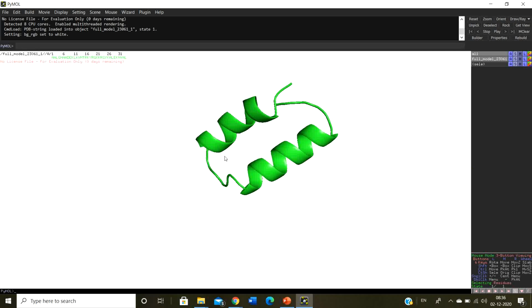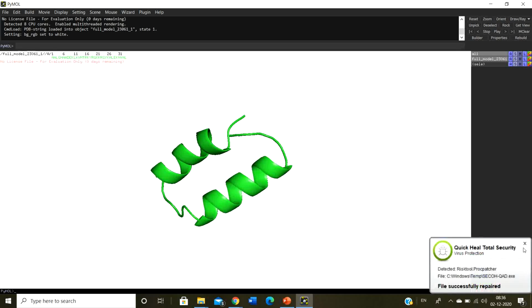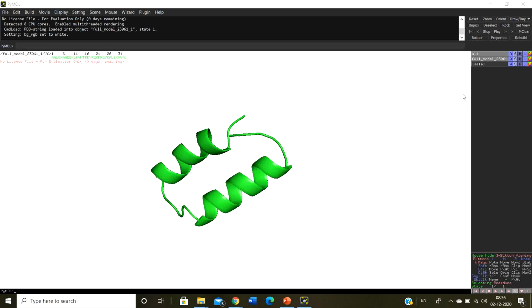Now you see there are several panels or boxes called A, S, H, L, C on the right side. There's one called all, and beneath all you are going to have your model. The model you select is going to have that particular model. Anything that belongs to all, if you click any button in the all panel, it's going to change everything that is on your screen. Why is it important?